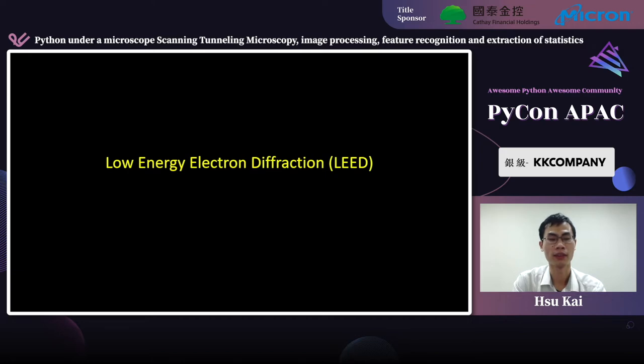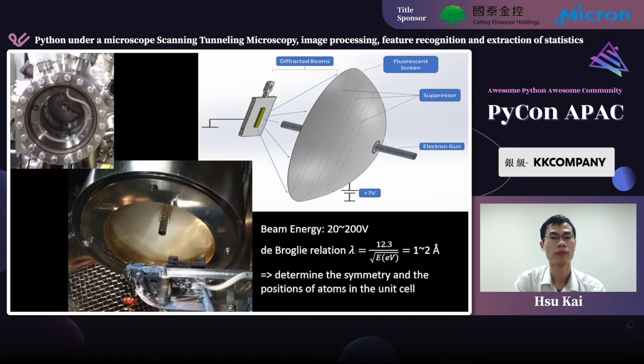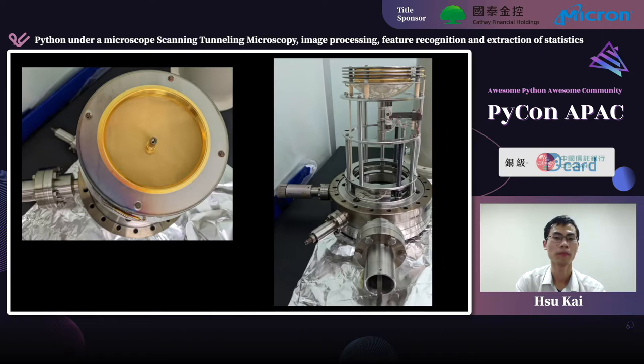Let's talk about the next technique, low-energy electron diffraction. Here is our LEED system. It is also an ultra-high vacuum system. The camera is outside in air and focuses on the phosphorous screen. On the top right corner is a cartoon picture of the setup. The electrons coming out from the electron gun have wavelength comparable to atomic spacing and can be elastically scattered by the atoms in the top few layers of the sample. Such LEED penetration can be used to determine the symmetry and positions of atoms in the unit cell. So, basically, we can view LEED image as the Fourier transform of the atomic resolution image from STM.